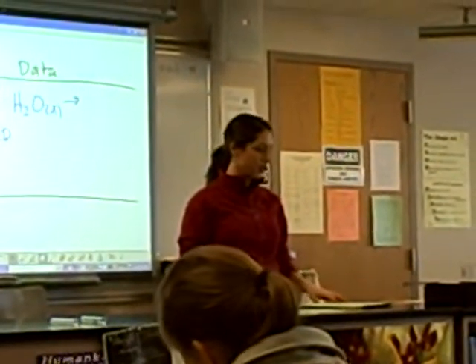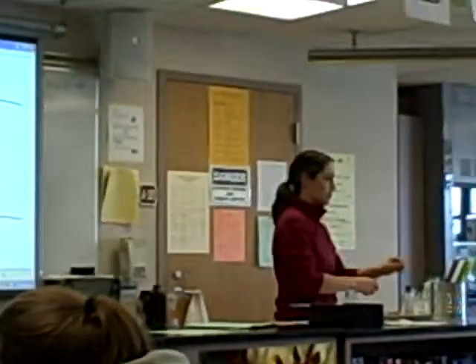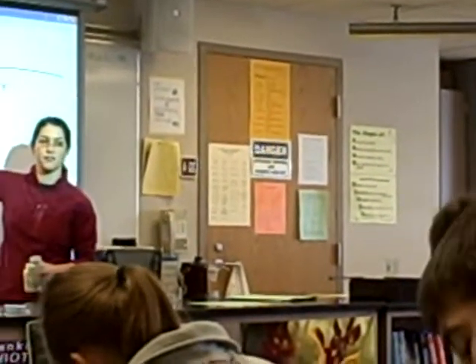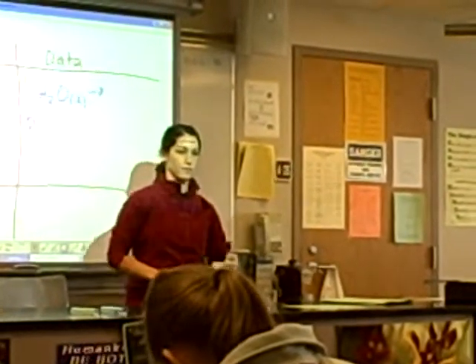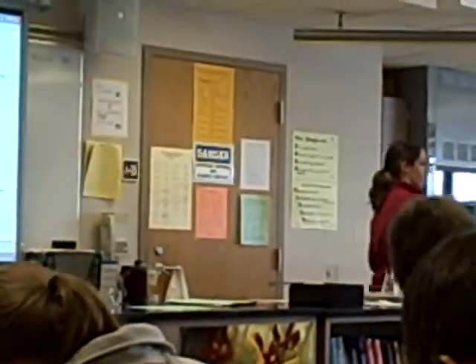Alright, so the second one, we're dealing with zinc and sulfur powder. So now should we draw the line? Yep, now I would draw a line. Make sure you guys have enough room to write your procedure in there. If you think you might need an extra line or two, leave some space and then draw your line. And then write number 2.